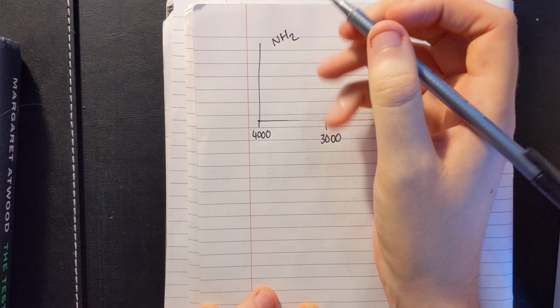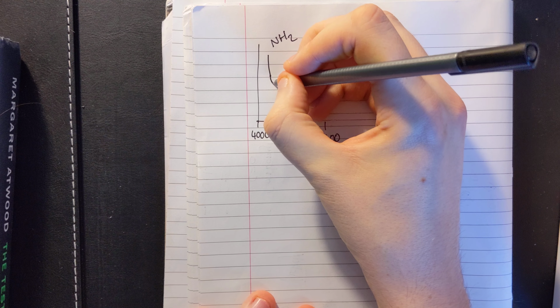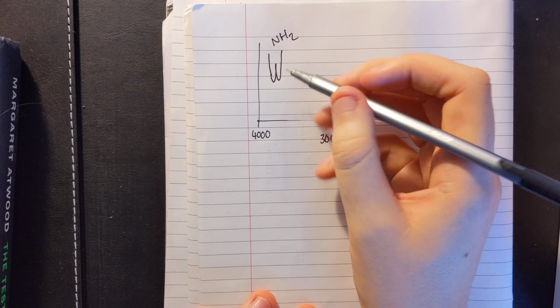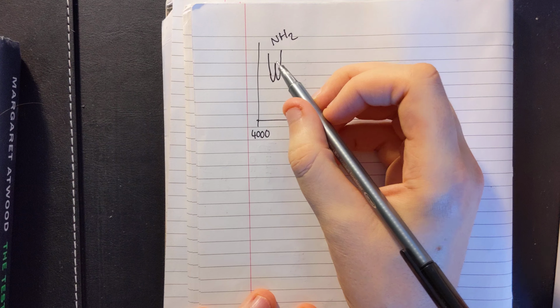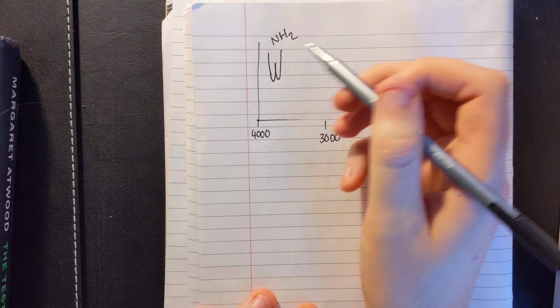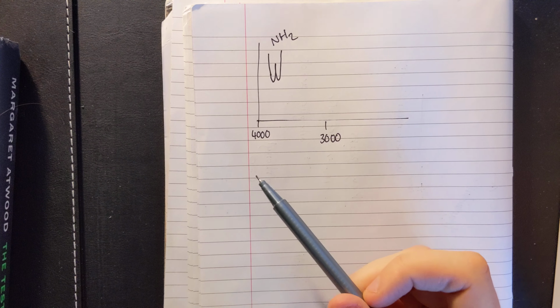And what makes it really, really obvious, it comes as a pair of peaks. So you don't just get one peak, you get a pair of them, forming a shape a bit like this. And sometimes maybe a bit pointier than that. But they're right next to each other. They're up at pretty high wave number. You'll very, very rarely see them, but they are on specification. They are on the data table.